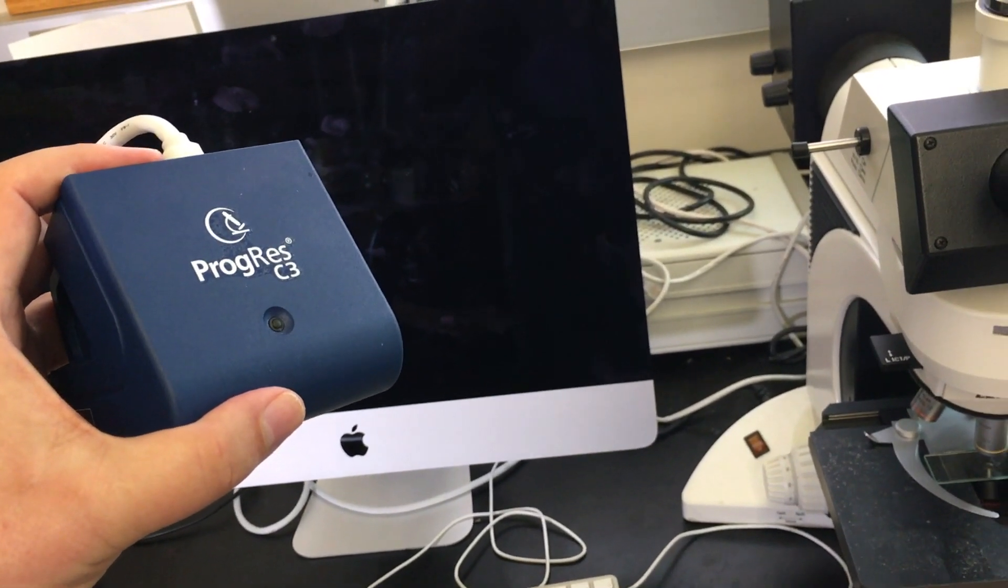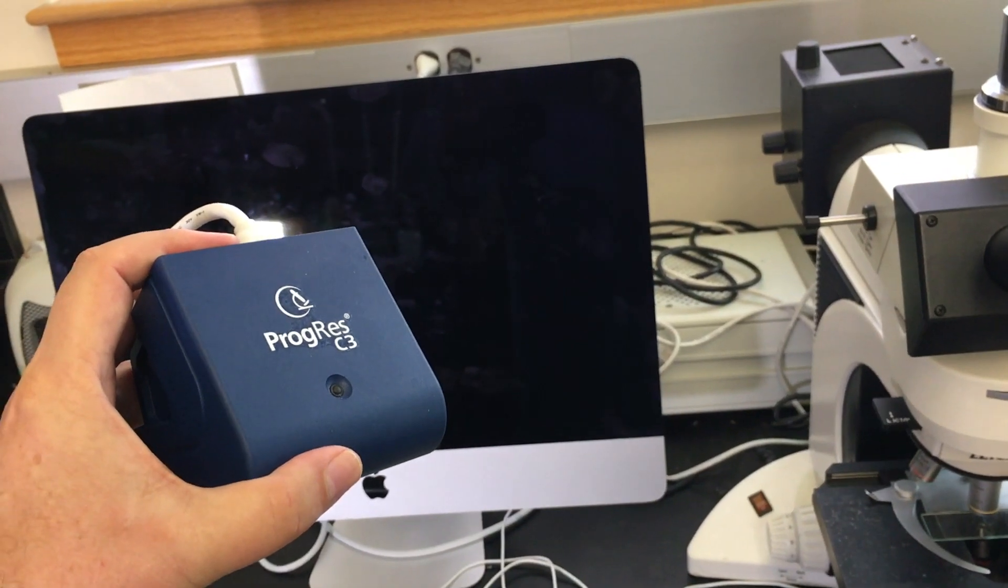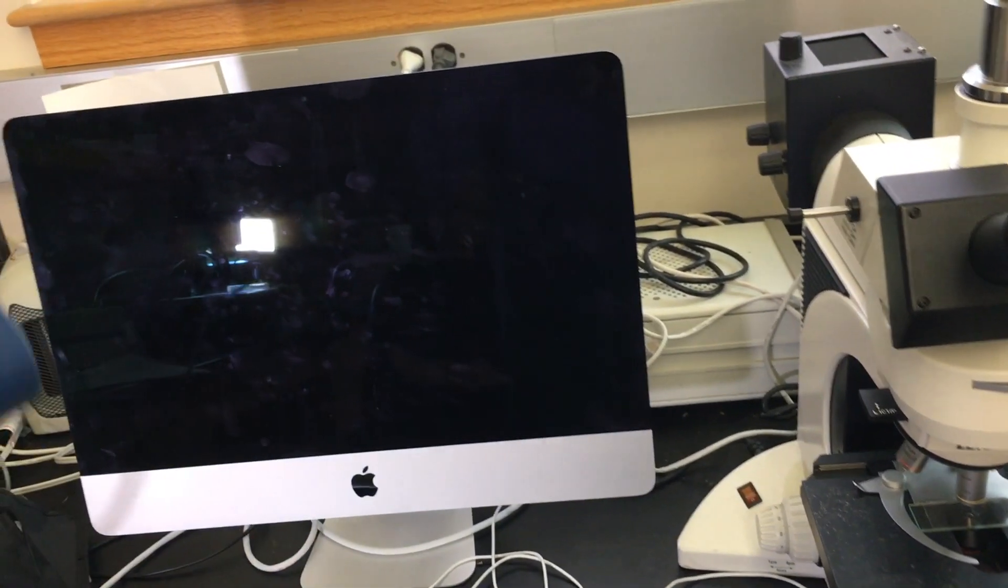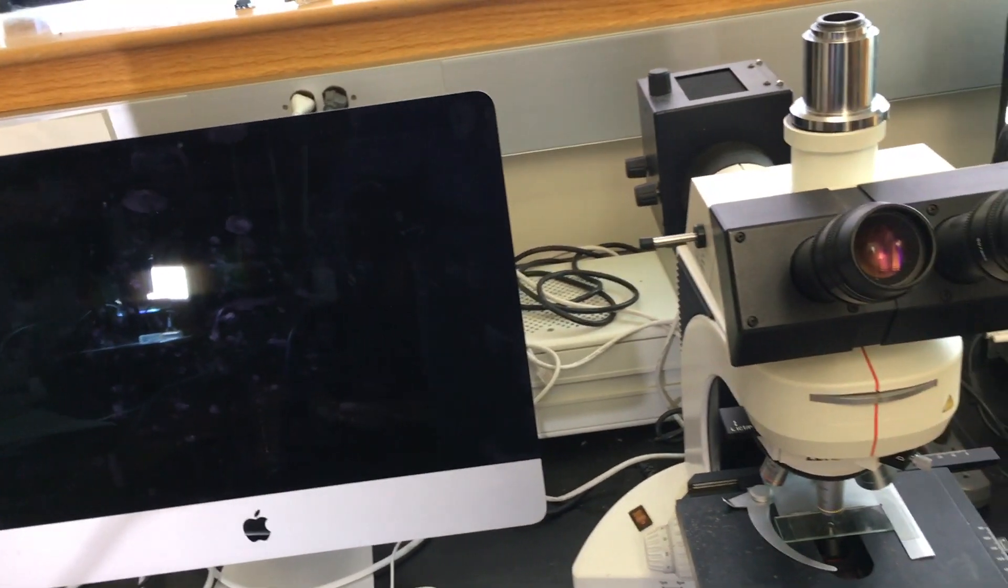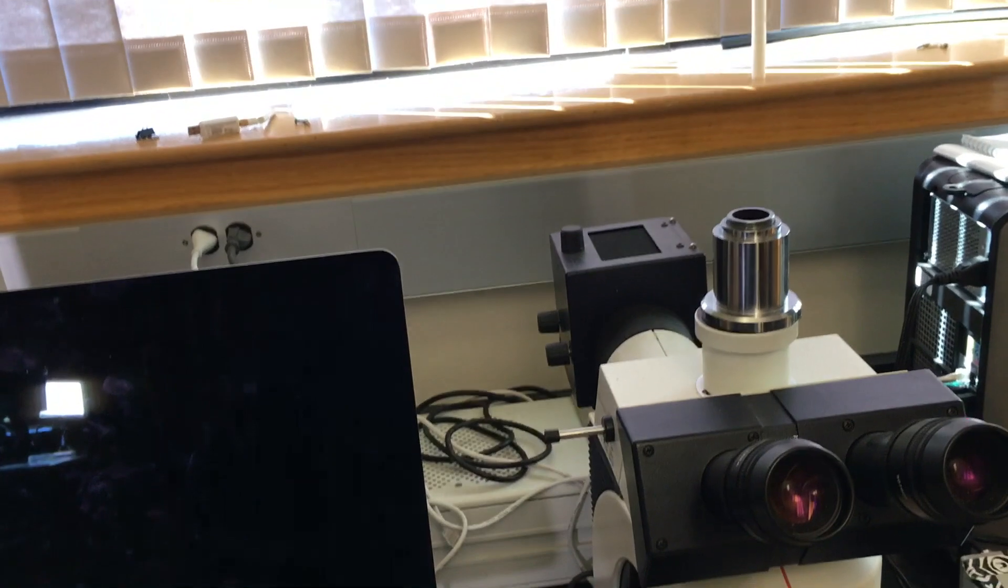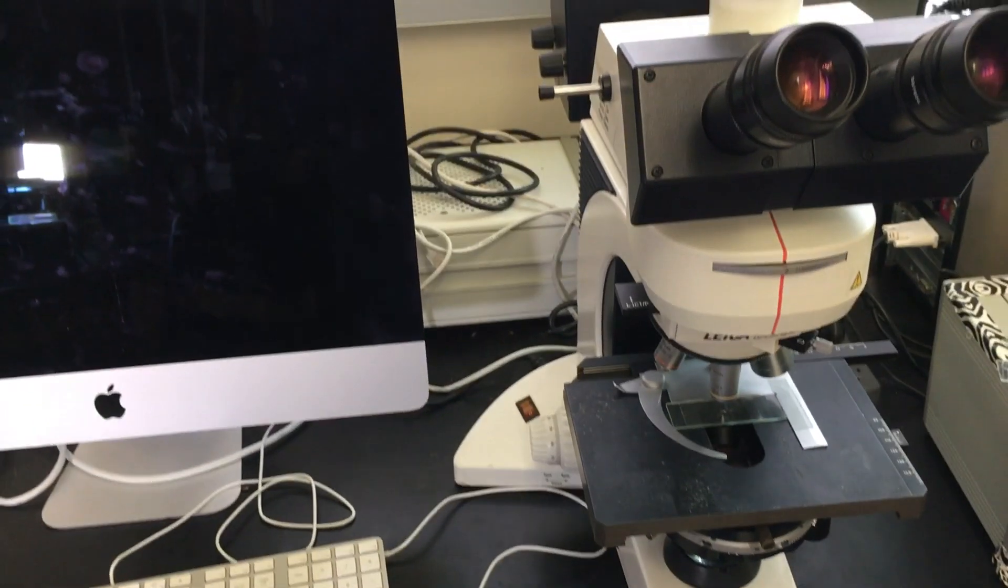I gotta say though, consumer electronics is progressing so fast that in many ways, this is much inferior to that standard consumer grade camera I use next door. Of course, I've also got an adapter here, I can probably use the old Canon on this microscope as well.